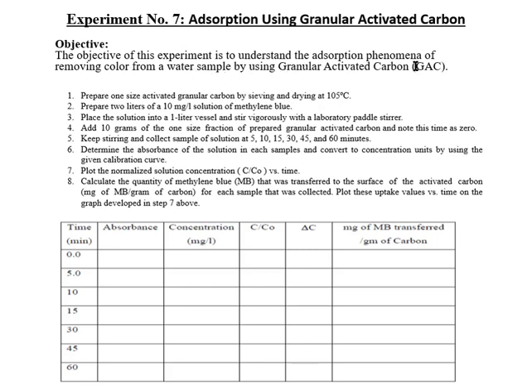using granular activated carbon. As I told in the theory class, granular activated carbon is like sand particles made of coal, faham. That is a special type of material which can be used to treat different types of wastewater. It can remove the color, it can remove the taste and odor, it can remove many other pollutants. So the procedure is already in your lab manual.